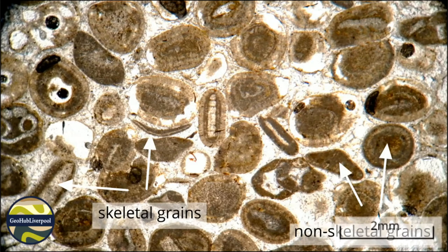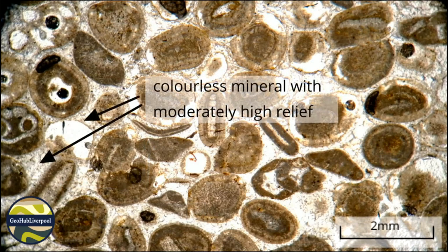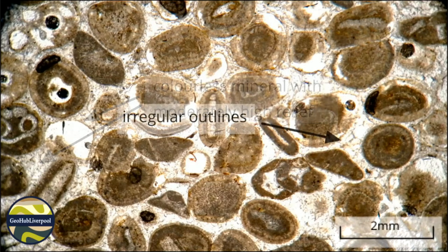Under plain polarised light, the skeletal and non-skeletal grains are surrounded by a colourless mineral with moderately high relief. This mineral is calcite. It is possible under plain polarised light to see the irregular outlines of these calcite crystals.